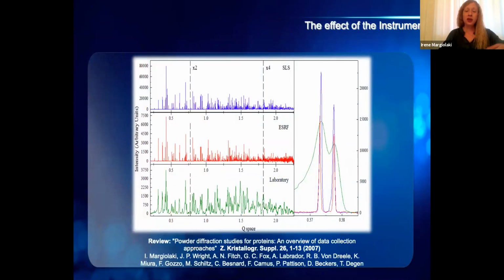So the effect of the instrument is tremendous, of course, and over the years, especially the years I've been working for the ESRF, we did a very exhaustive search on different instruments. You can read more about the instrumental effect in this publication. We collected data in the lab, ESRF, SLS. These are 3 data sets of octreotide. And if we look at 2 peaks, you see the effect of the instrument.